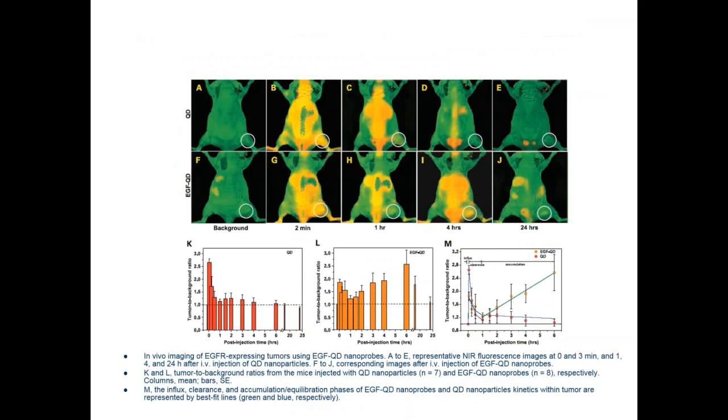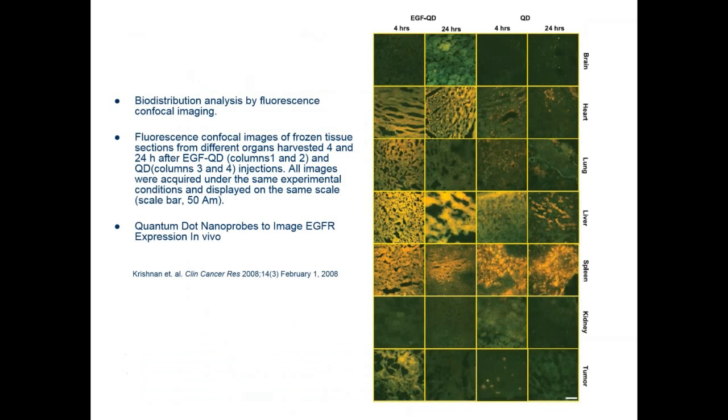That is, this type of labeling experiment can enhance the contrast versus an unlabeled sample for a specific biodistribution within an animal model. Or specifically here, you can see the enhancement of adding a growth factor on a quantum dot versus a quantum dot that has not been bioconjugated. And here, just for a general comparison, you can see the enhancement in the imaging setup.